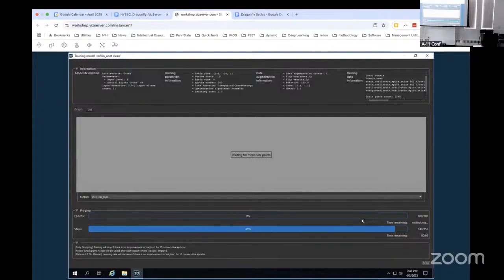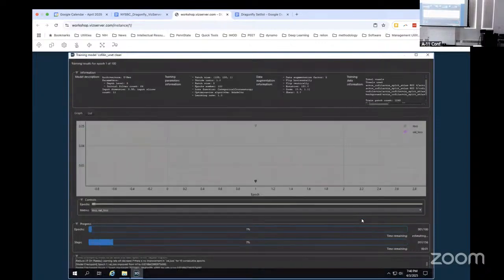Anyone totally confused? Need a reminder? Can you remind me how you got the multi-ROI for the synthetic data set? Did you do that manually? The simulator spits out the synthetic data atlas, and then you just import that into Dragonfly.